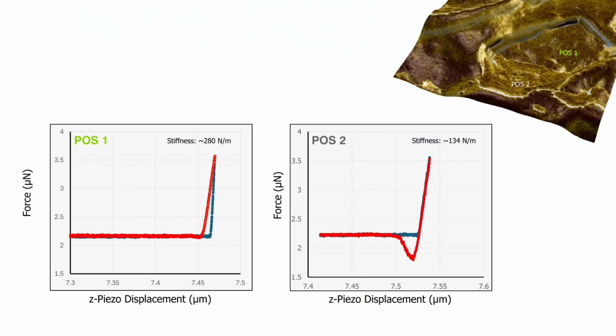The good thing here is, with the FusionScope, you can also do force distance curve measurements on these different spots. Due to the profile view and also using the SEM, you can see exactly, okay, now I'm landing at this position where I want to land. Our results show exactly what we thought.